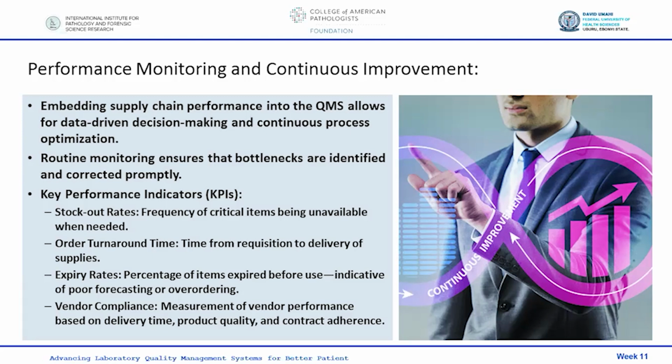Order turnaround time. That is the time from requisition, when you make your order, to the delivery of the supplies. Okay, is it long? Is it longer than it should be? Is it unnecessarily long? These are things that you should also consider as a key performance indicator.